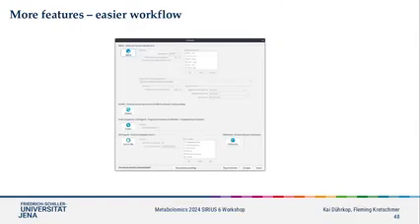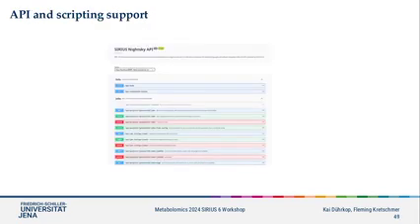We also simplified the computation workflow a little bit, first by hiding a lot of options in a show-at-once settings dialog, and also it's now a little bit streamlined, like you don't have to do a Canopus prediction separately and so on.